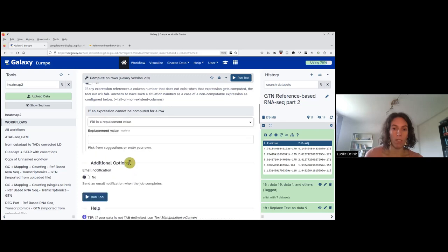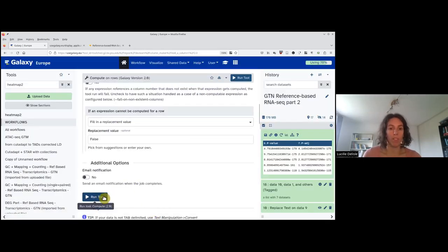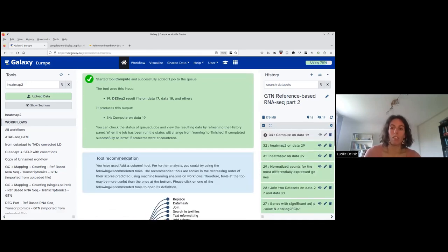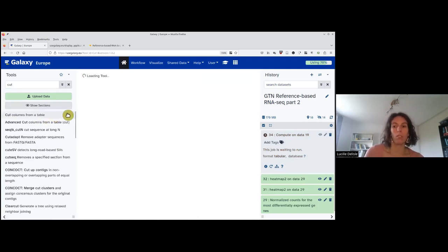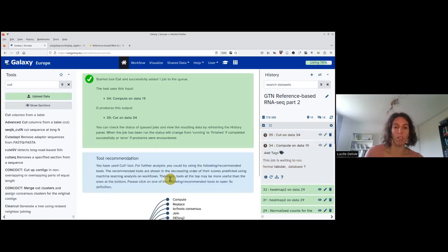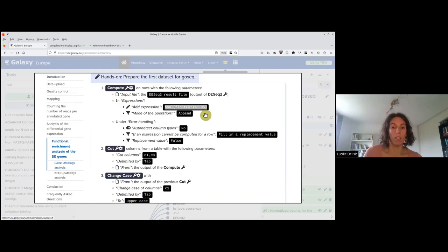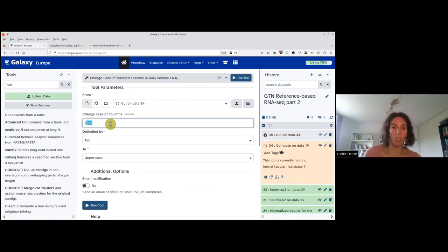This will be a tabular with the value of interest in the eighth column. So we use the 'cut' tool to get only the first column and the eighth column, applied to the compute output. We are close to having the right input, but remember we need the first column to be uppercase. For this, we use the 'change case' tool, changing column one to uppercase from the cut output. When all these steps are done, I resume the video.